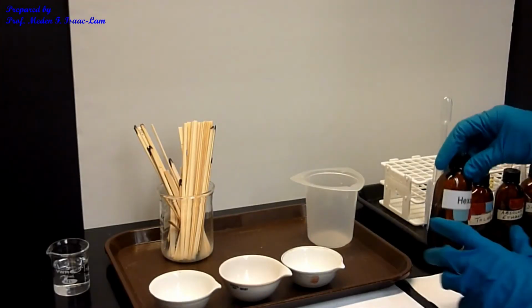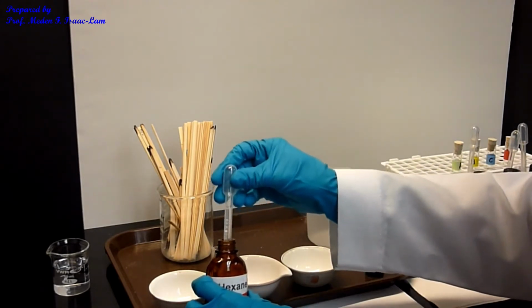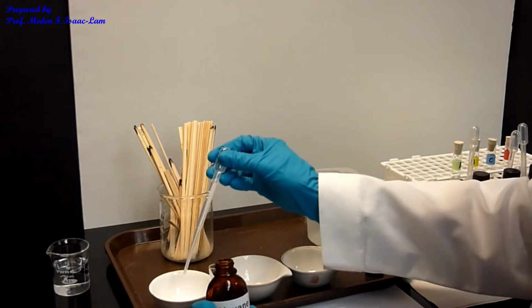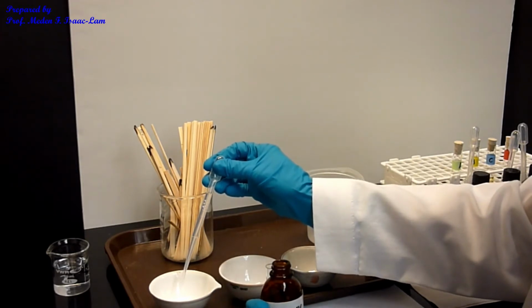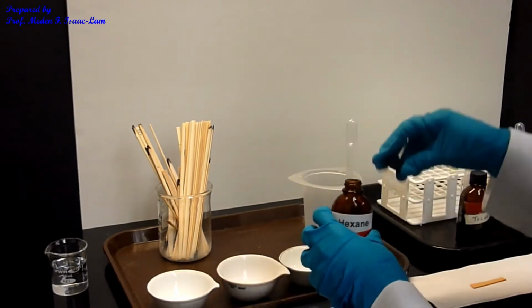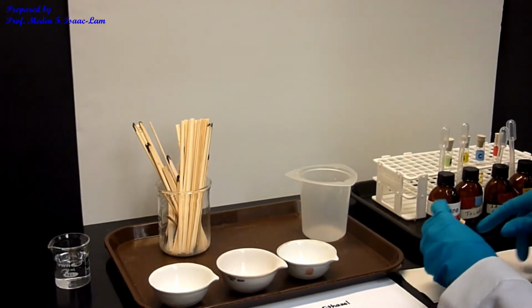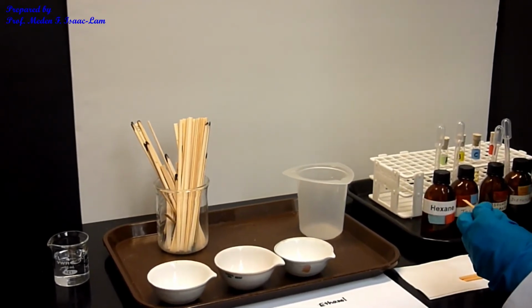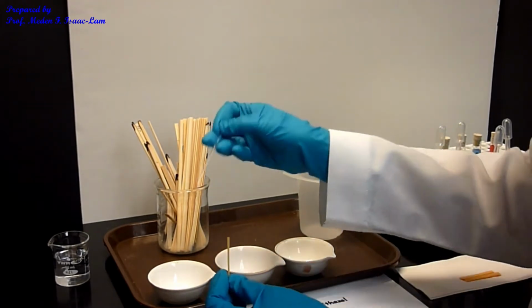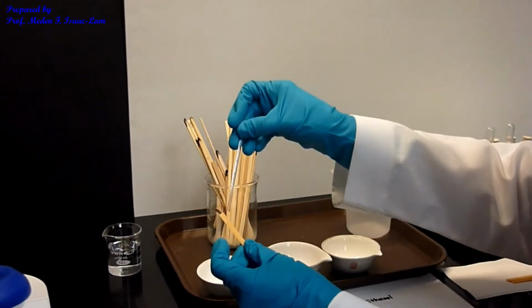So I'm gonna put 8 drops of the hexane sample in here in the evaporating dish. So 1, 2, 3, 4, 5, 6, 7, 8. Okay. And then put the lid, and then I'm gonna use a stir stick. So I will use a stir stick, and I still have the liquid in here, and then I will put it here.